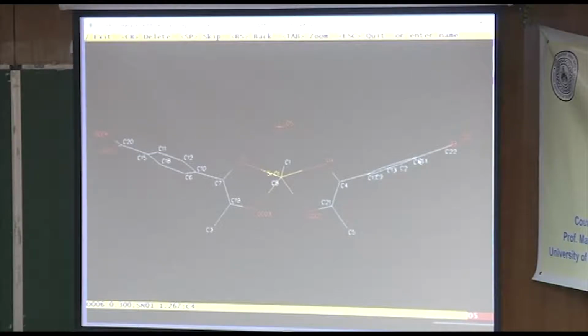I'm not worrying about doing it in order because I may change the atom type later and then I'll just have to do it again anyway.